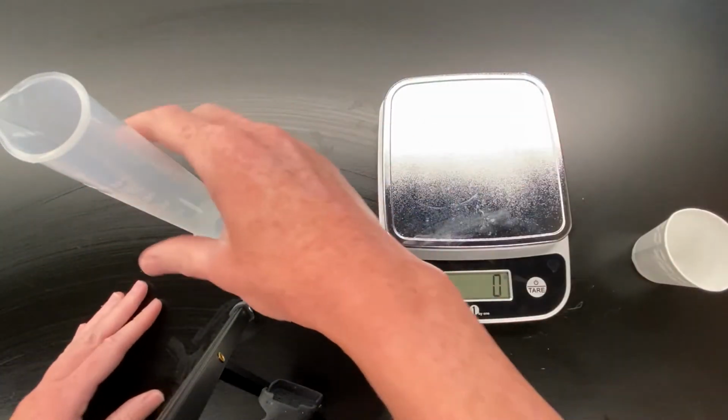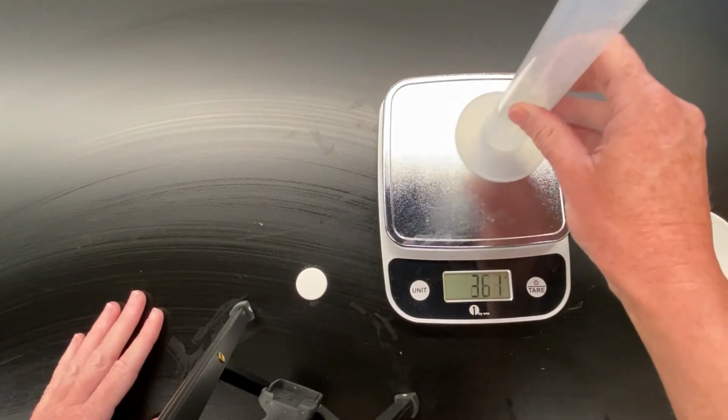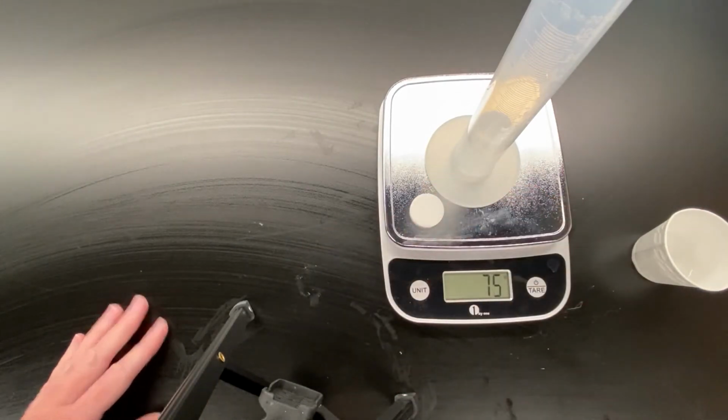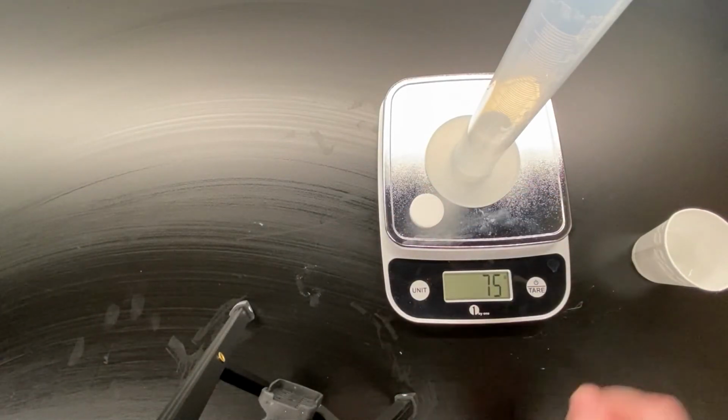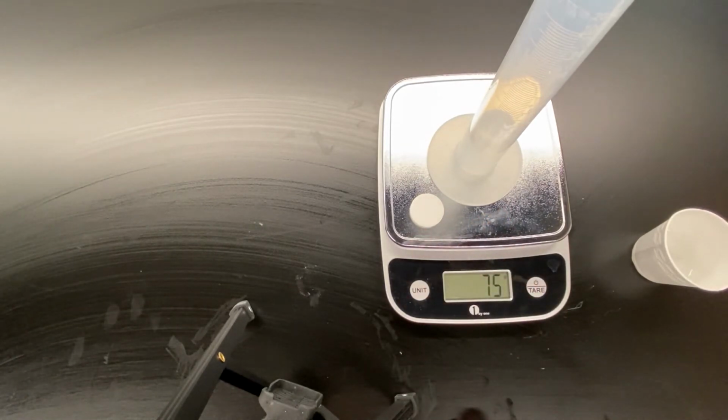Then you're going to put the graduated cylinder in the center of the balance. Don't put it all the way over here, put it right there in the center. And then you're going to put the tablet onto the balance. So you're going to weigh the container with the water in it and the tablet. Okay, you're going to record that in water plus container plus tablet space.